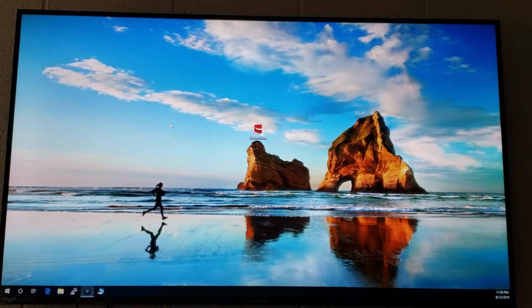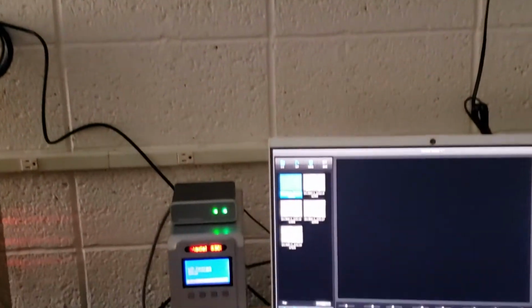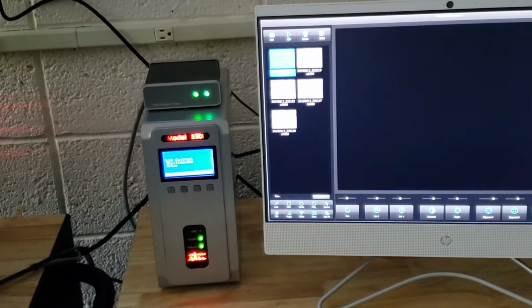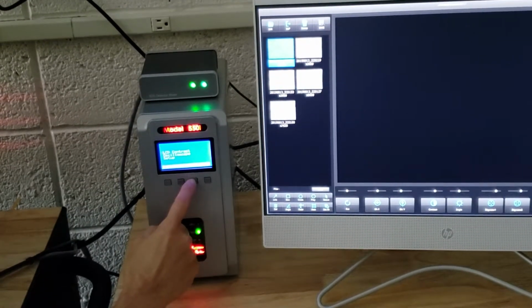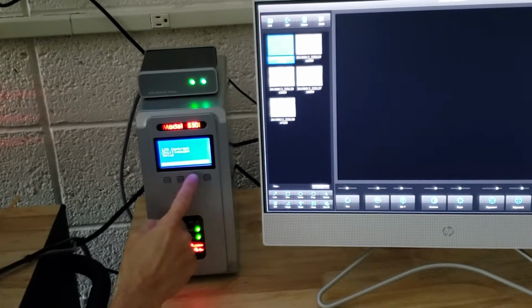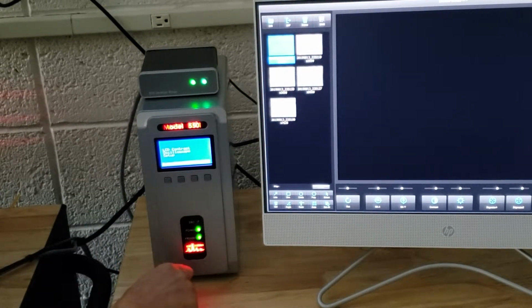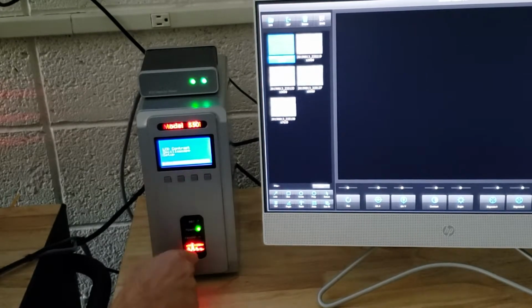Displayed on our graphics on our LCD display window. As soon as I hit enter, the first thing you see is LCD contrast, oscilloscope, and setup. And we have left and right arrows, a plus, a minus, and an exit. If I highlight plus, it moves to oscilloscope, the next feature. If I highlight plus, it goes to setup. Minus, it brings me back to oscilloscope. Minus, it brings me back to LCD contrast. If I just hit plus, it'll continuously scroll through all the features.